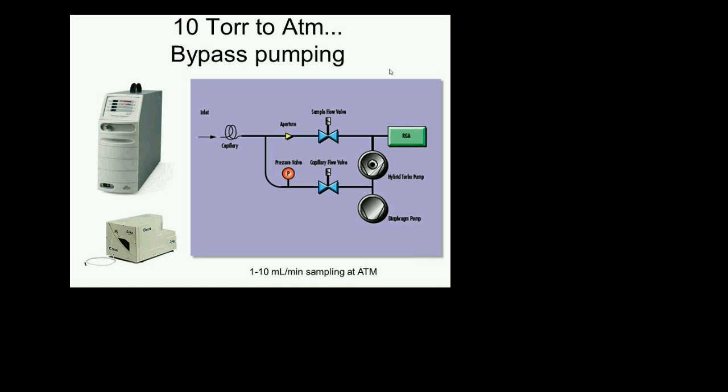The only thing that changes is that you have this pumping system in the front end of it that will allow you to bring the pressure down to a value that is compatible with the RGA. So with that, I think I've covered everything that I think we can humanly cover in 4 hours.